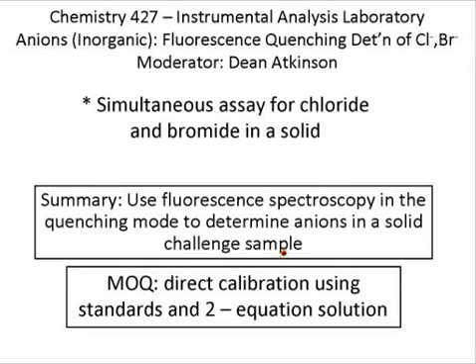So you're going to use standards that you create. In this case, it's going to turn out that you need to make a set of different standards, and the actual solution for the chloride and bromide, similar to what's done in the pH lab, will actually come from the solution of two simultaneous linear equations.